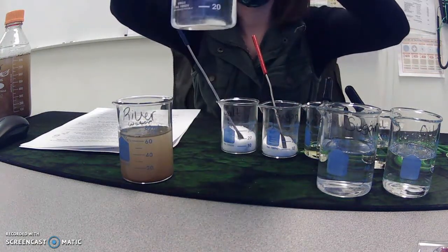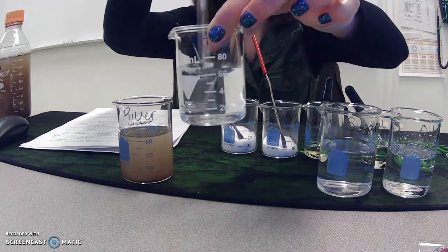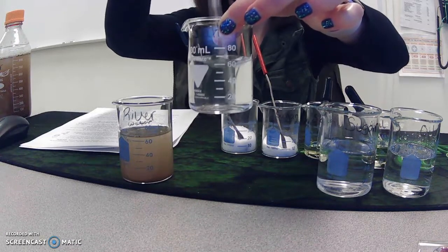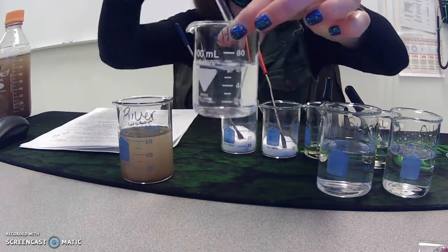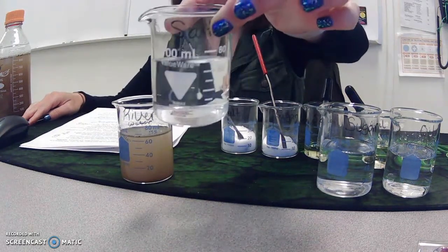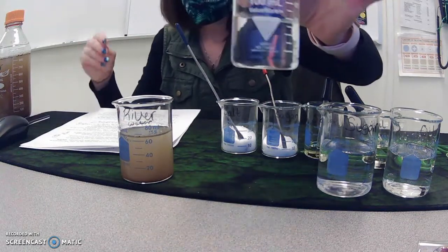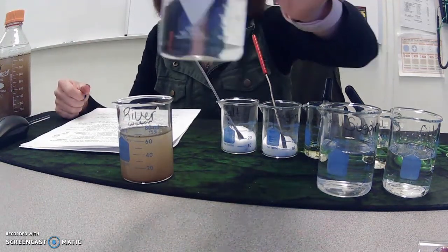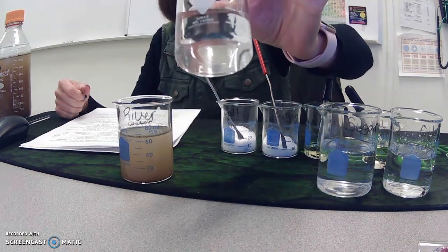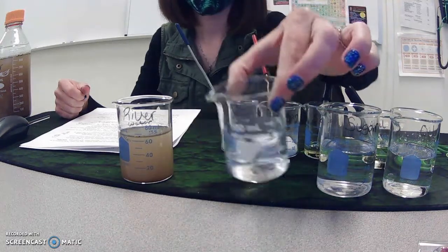As we begin to stir it in the water, okay, so it was at the bottom, lots of granules. Does it dissolve in water? Do you still see it? If you do not, then yes, it does dissolve in water. If you still see something, then no, it does not dissolve in water.